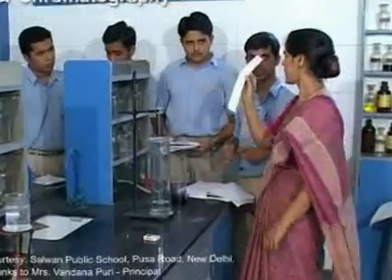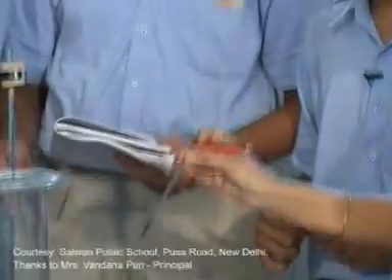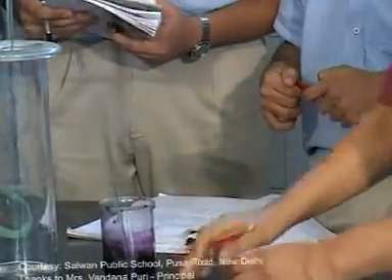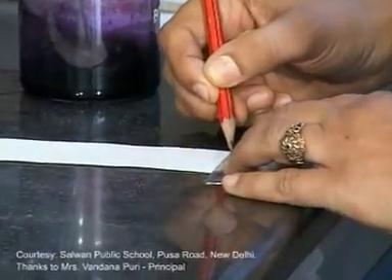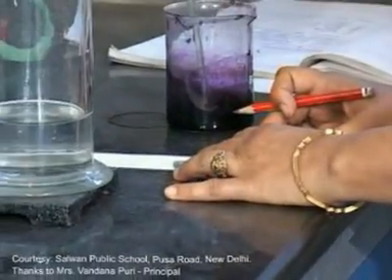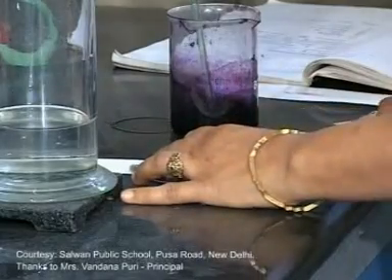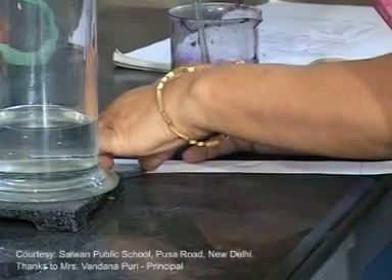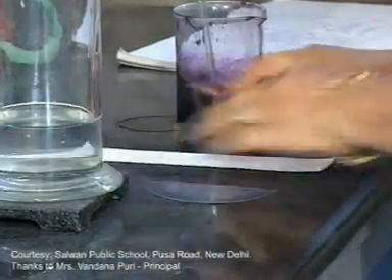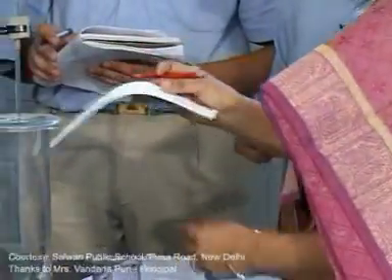This is your Whatman filter paper number one, a beaker, a fine capillary tube, and a pencil. Let's draw a horizontal line four centimeters from the base. Then draw another vertical line from the center of the horizontal line, which will divide the paper exactly into two halves. The point where the two lines meet, let's name it O.